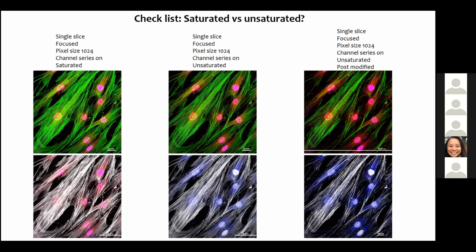If your data is a very simple yes or no, and you have no staining in your wild type, and you have some staining in your treated sample, then it becomes easy to sell that data. However, if you have very slight changes in your protein expression or whatever you're looking for, then selling that data becomes very hard through immunofluorescence. And to back that up, you need to have some kind of quantification to go with those images.